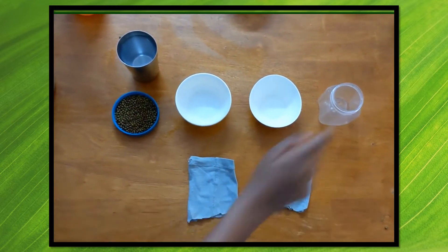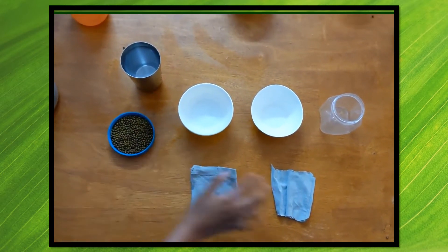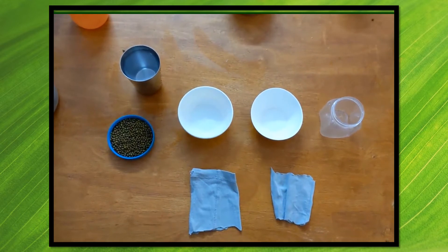For this experiment I'll be using some water, two plastic cups in one container, some green gram seeds, and two pieces of cloth — you can also use cotton.